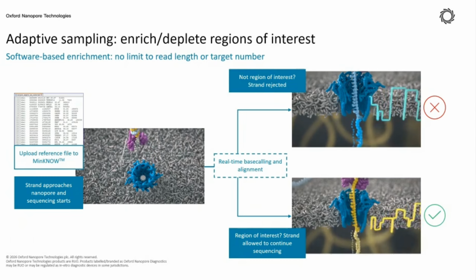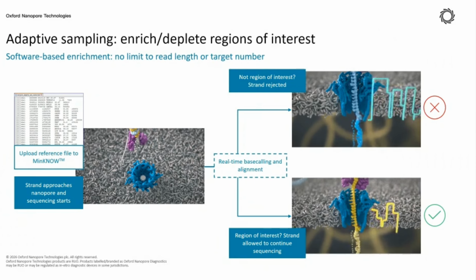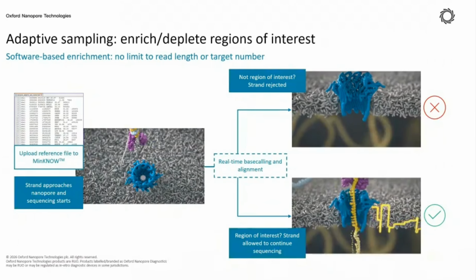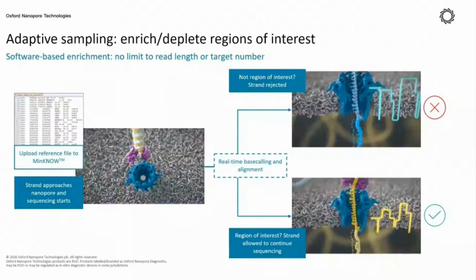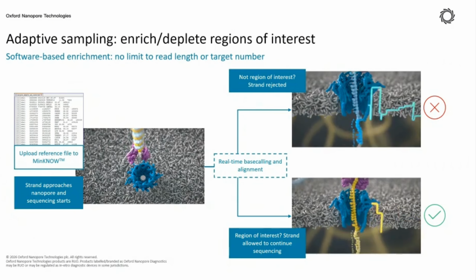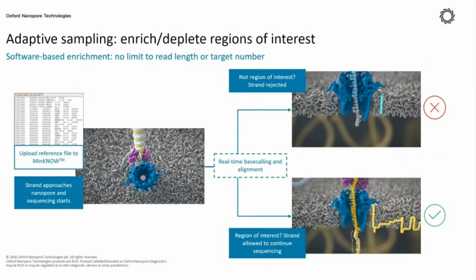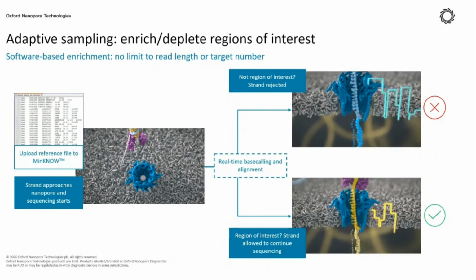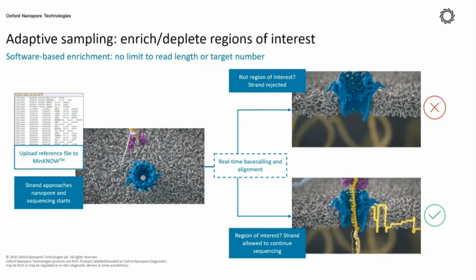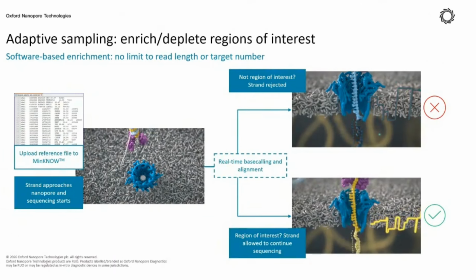This is also quite often used for human genome sequencing, especially because the human genome is relatively big. Its genome size is 3 GB or more. So sometimes we do not really want to sequence the whole 3 GB of it. We could be targeting just a few hundred genes. We want to have a quick look into those genes while we are sequencing the whole genome. Then we can inform the software what our target regions are.